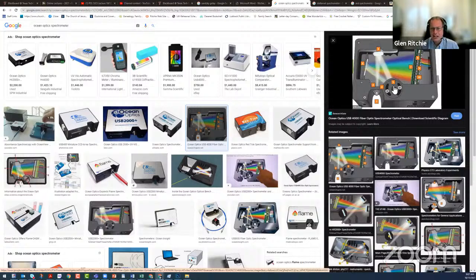And in each of these steps, it disperses the light and increases the optical path so that the light can be dispersed more and more. And then you have a line of what's called either a photodiode array or a CCD array, where you're essentially scattering the light out, and each of these individual sensors is made out of silicon, and it detects the quantity of light that comes to it through this process.